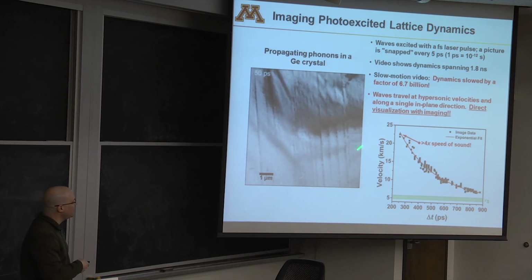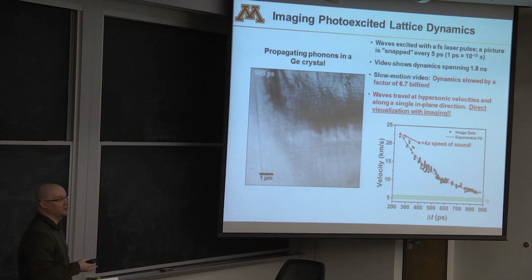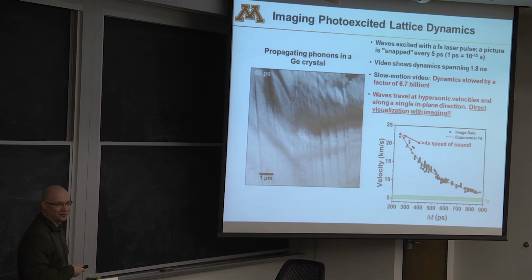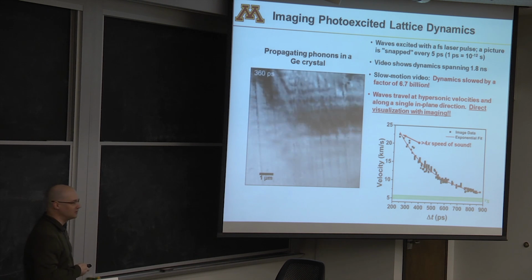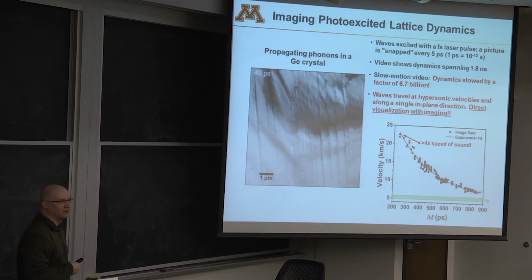Okay, and in fact, we've measured waves going about 7 times the speed of sound in this material. And that's not a mistake, it's real. We've reproduced it, it's a real thing. So we're still trying to understand that too, as you can imagine. Why are these things moving at such high velocities? Okay, so very, very, very interesting stuff. So much information in this one video alone that we're still trying to unravel what's going on. Okay? So that's it. I'm going to stop there.